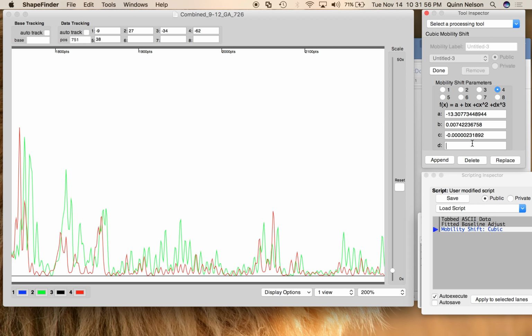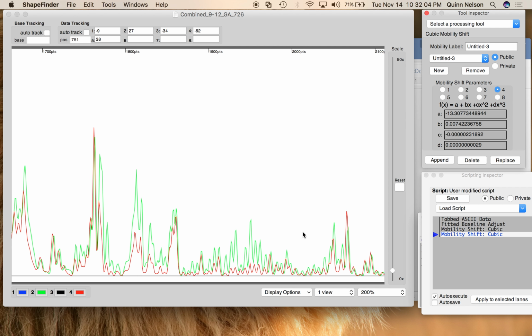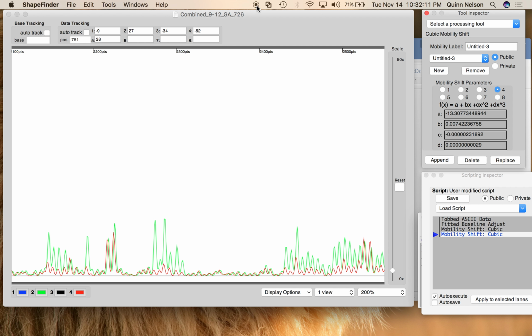I'm running up on my time here. Good. So we're done here with channel 4. It's done. We're going to append. And look, it's shifted. It's aligned pretty good. So we'll stop here and move on to the next channels in the following video.